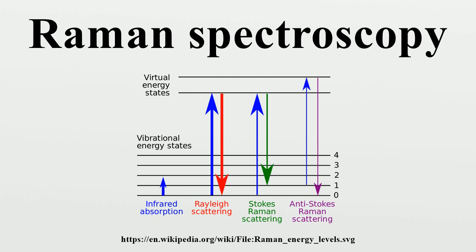Systematic pioneering theory of the Raman effect was developed by Czechoslovak physicist George Plaček between 1930 and 1934. The mercury arc became the principal light source, first with photographic detection and then with spectrophotometric detection. In the years following its discovery, Raman spectroscopy was used to provide the first catalogue of molecular vibrational frequencies.